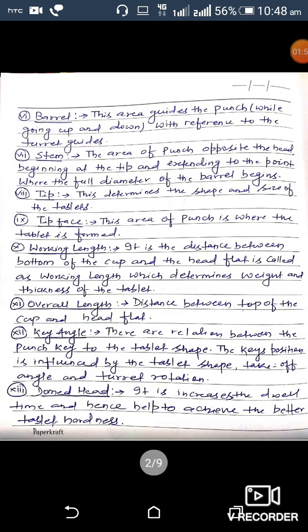Sixth is barrel: the area that guides the punch while going up and down with reference to the turret guides. Seventh is stem: the area of the punch opposite the head, beginning at the tip and extending to the point where the full diameter of the barrel begins. Eighth is tip: this determines the shape and size of the tablet. Ninth is tip face: the area of the punch where the tablet is formed.